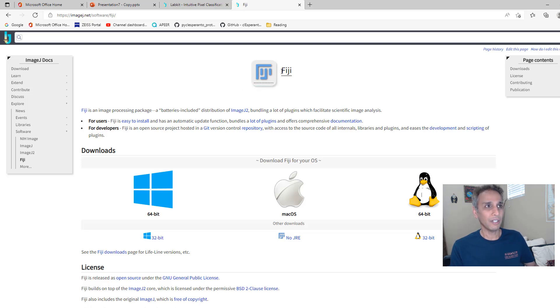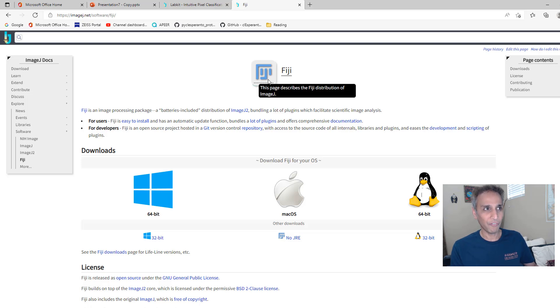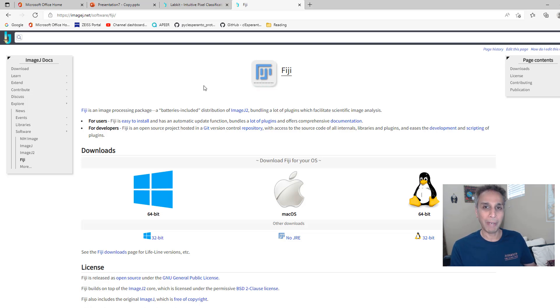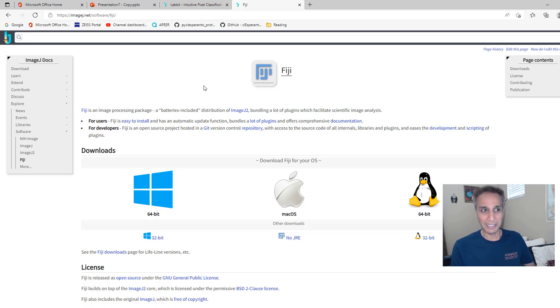Fiji stands for Fiji is just ImageJ. So then why is it called Fiji? Because it comes with a whole bunch of prepackaged commonly used plugins. So it makes your life easy.